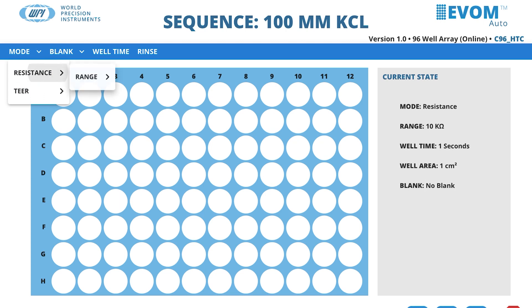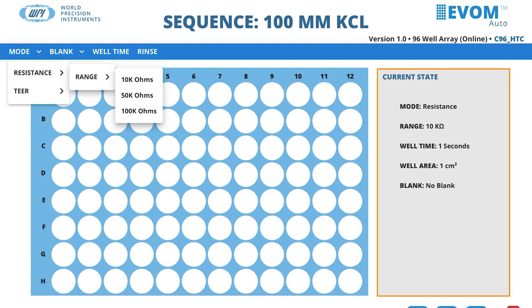When you select the Mode Resistance Range, you can choose the resistance range for making measurements. Options include 10k ohms, 50k ohms, and 100k ohms. The current state area on the right side of the window updates accordingly.